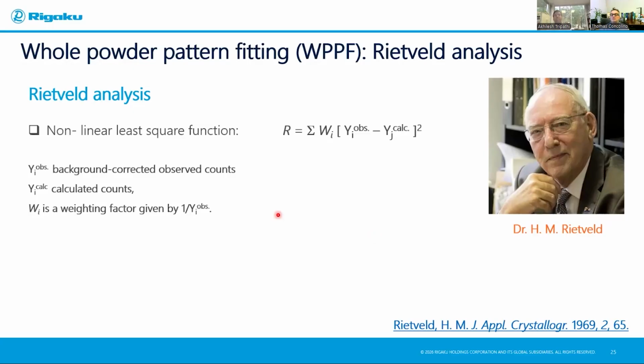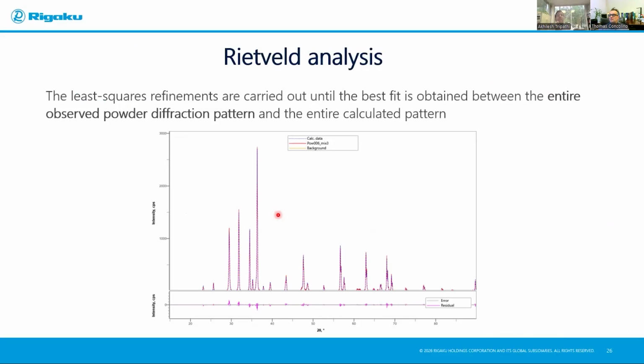And let's dig a little bit deeper into this program to understand, so that when we use this program, we could utilize all the features that are available in this program. So first, what is a Rietveld program doing?